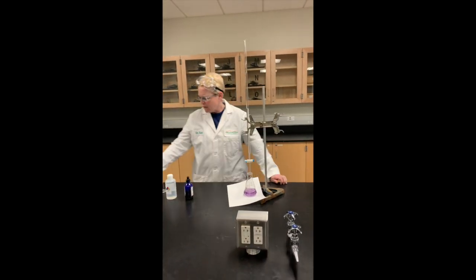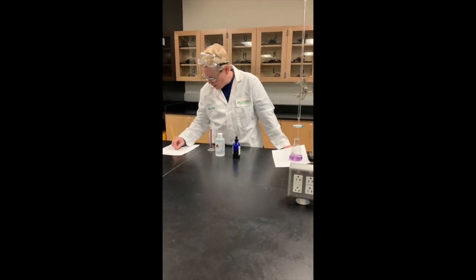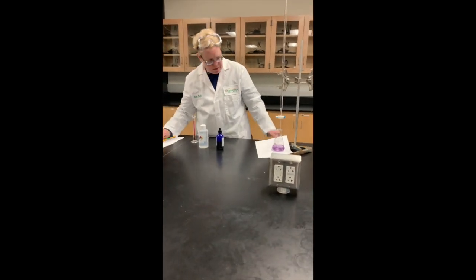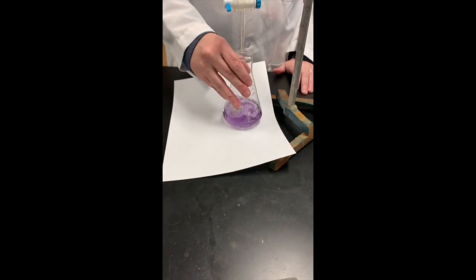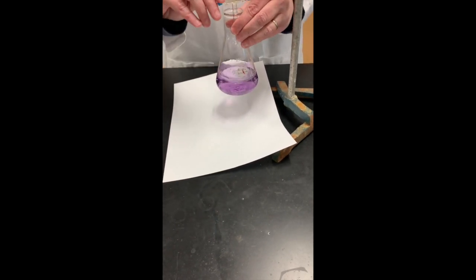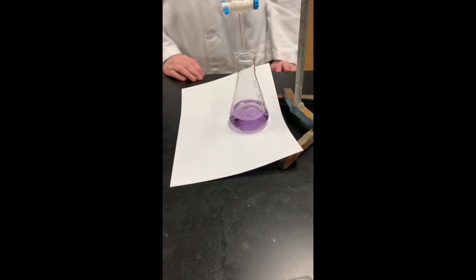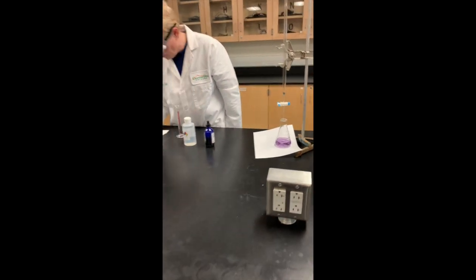Now, I'm going to write that down. I'm going to put it as 28.60. And I'm going to go ahead and add a little bit more just to see if I do get a different color change, because I still think that's a little bit purple, but I don't want to add too much and then have it not change on me. You can see it's not really changing. So I would say that probably that original one was where it was going to change. So we'll go with 28.6 milliliters for that final.